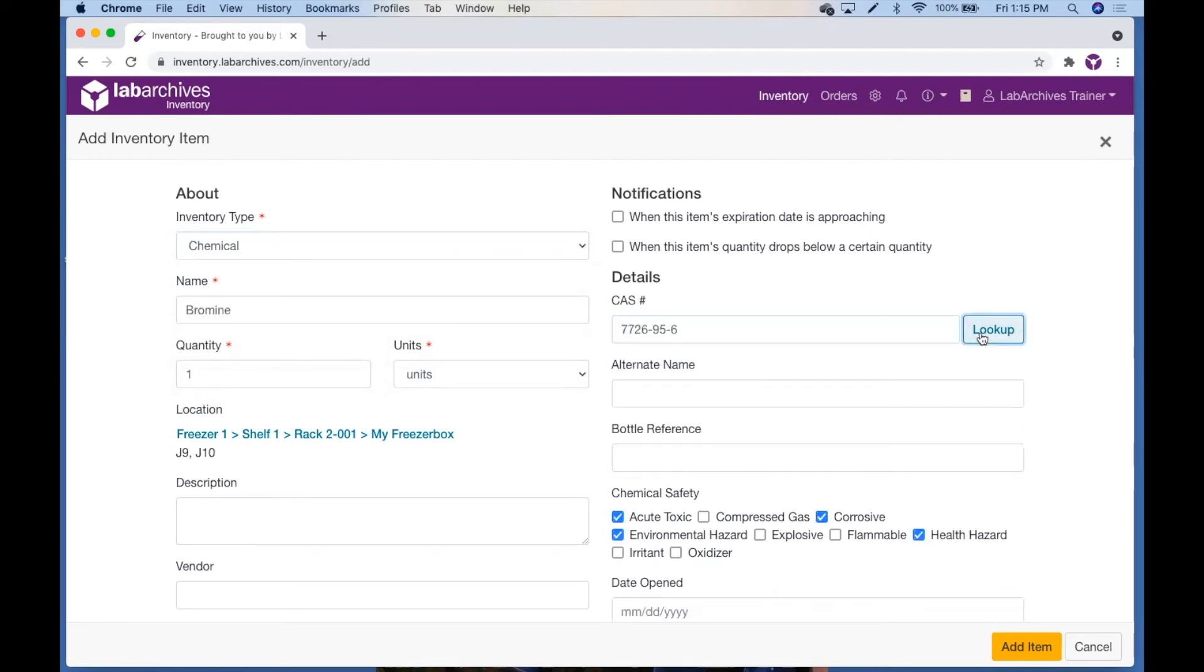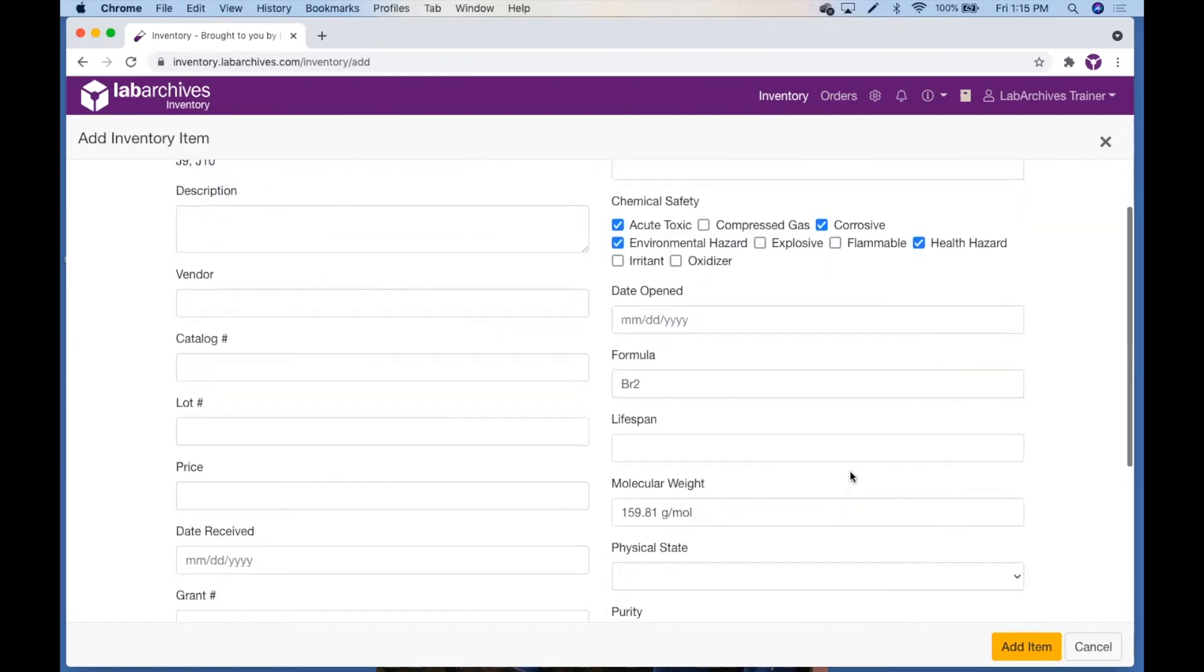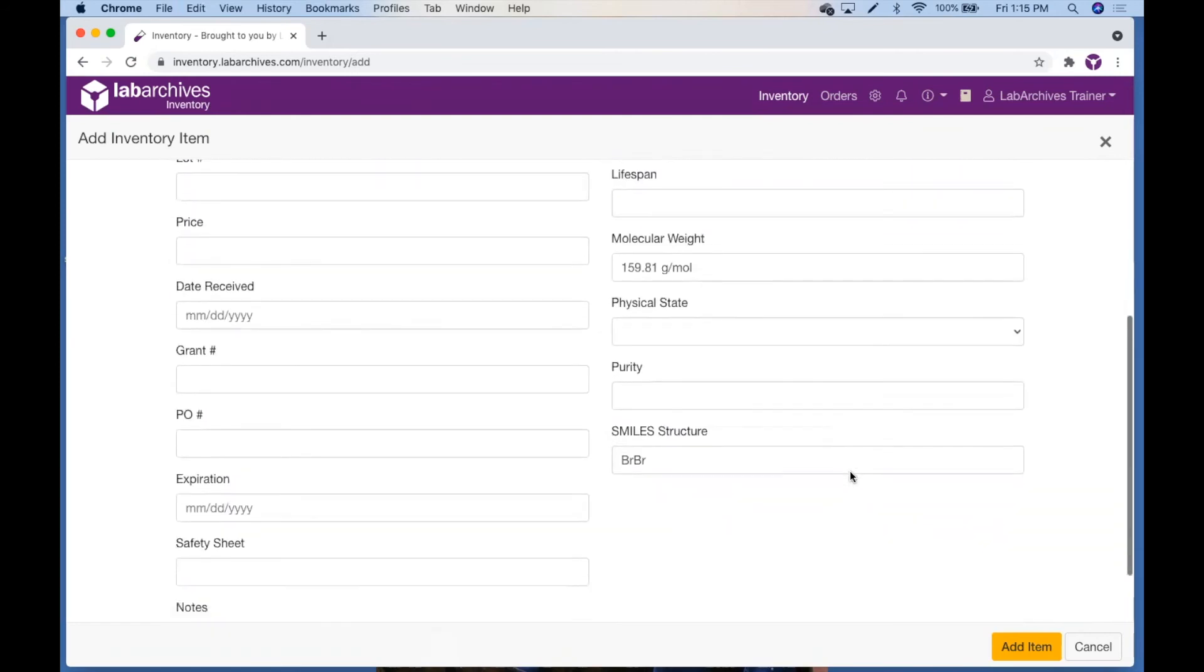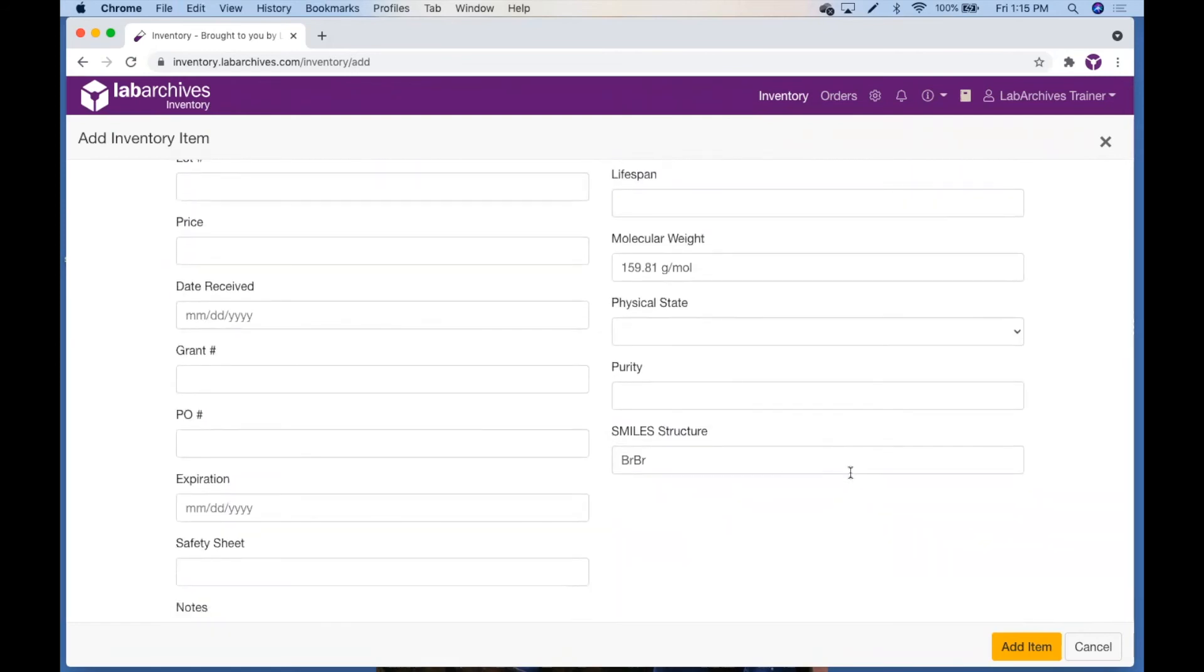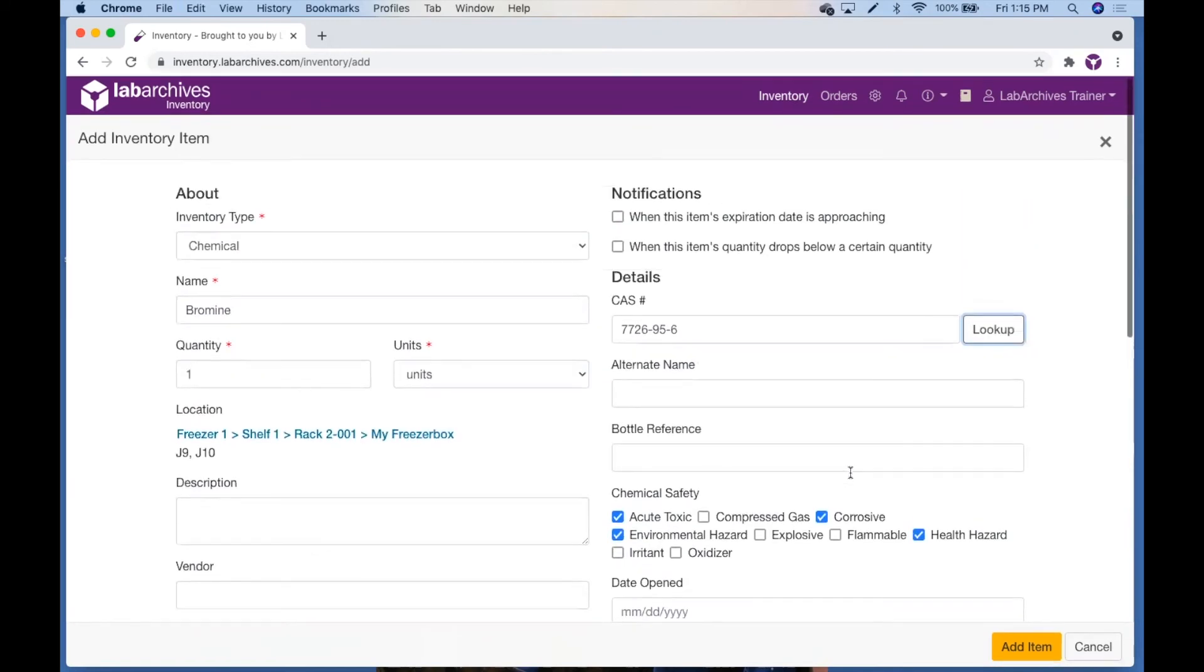You'll then notice that the chemical safety, formula, molecular weight, and smile structure fields are filled in for you. If you have not entered a name before doing the lookup, it will also add the chemical name for you. But this will not overwrite an existing name you have already given this item.